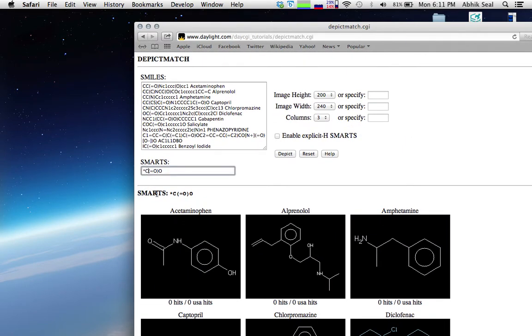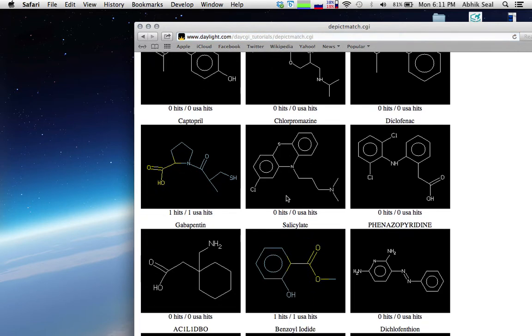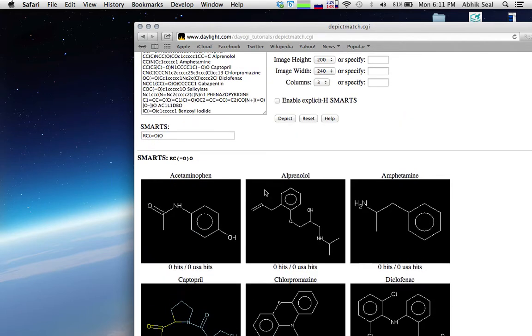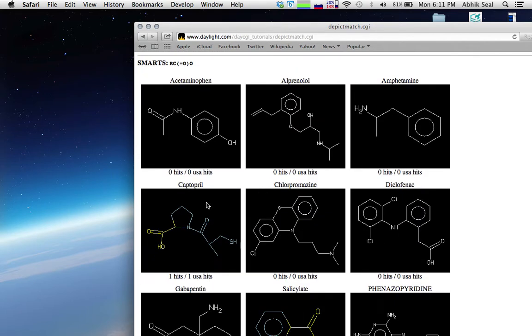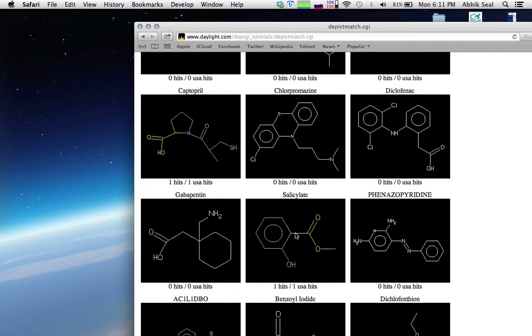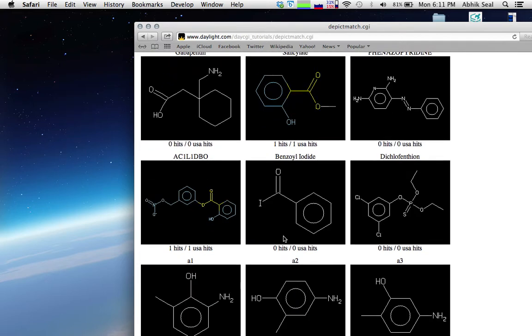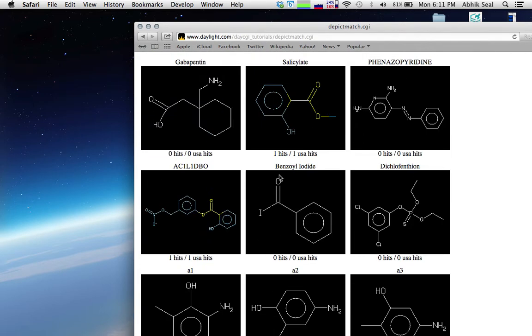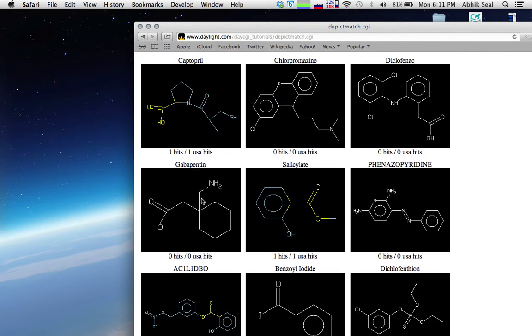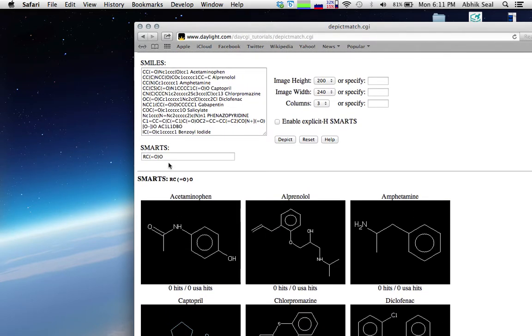If you want to find a carboxyl group that is attached to a ring, you can modify the pattern. Now only carboxyl groups attached to rings are shown — there is only one hit for this compound, and also one for this compound.